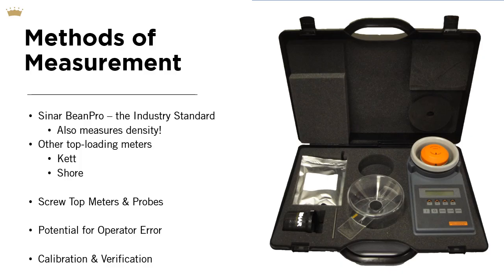There are a number of screw-top meters and probe-style meters that are available also, in varying degrees of expense, and I have found that those are not terribly accurate in my experience. There's a lot of potential for operator error in those particular devices. In any measurement device, you're going to need to be precise and consistent with your measuring practices, and maintain calibration and verification through standards.